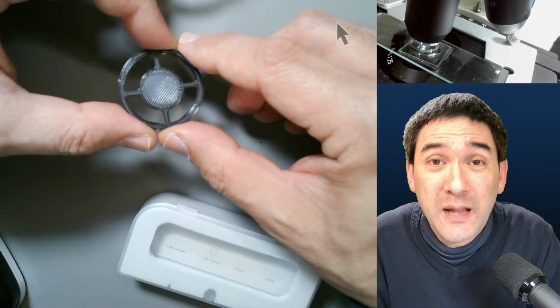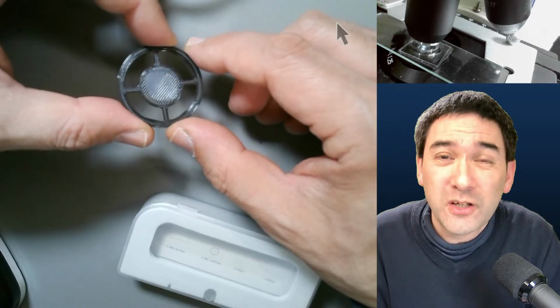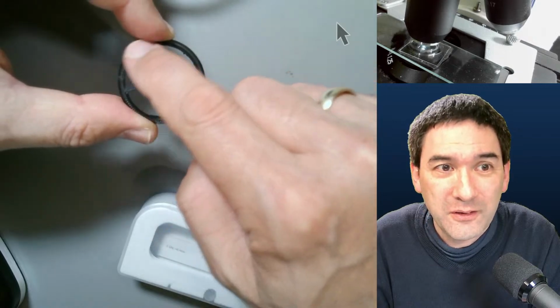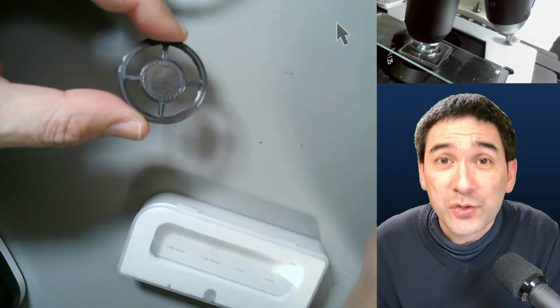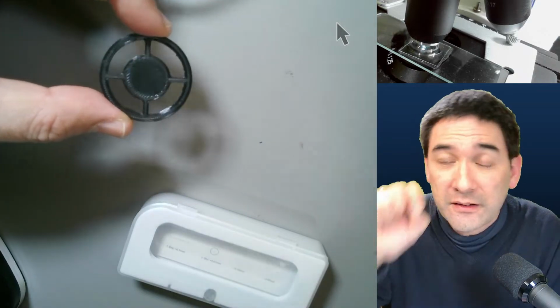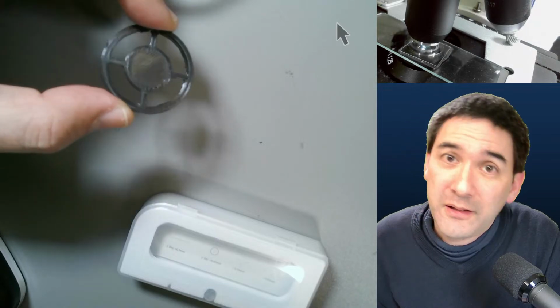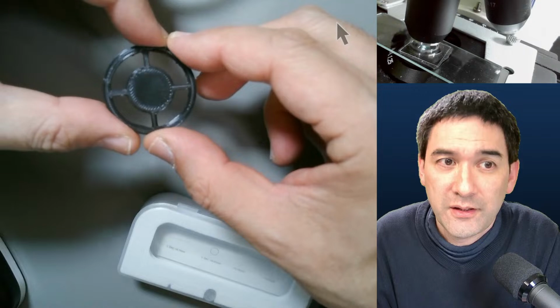But what happens if you want to have dark field with yet higher magnifications? It's going to be so dark that you're not able to see anything, because there's almost nothing left of the light. And for this reason, there are special dark field condensers which have the concave mirror system on the inside, kind of round mirrors that redirect the light. Maybe it depends a little bit on the dark field condenser that you have, but that's actually the ideal system here.